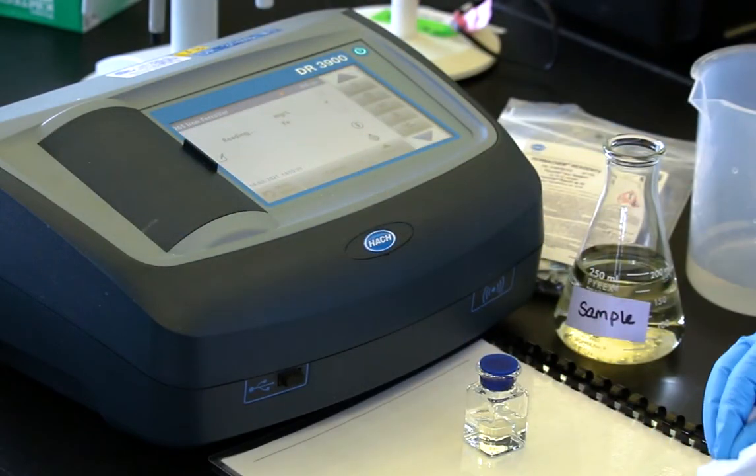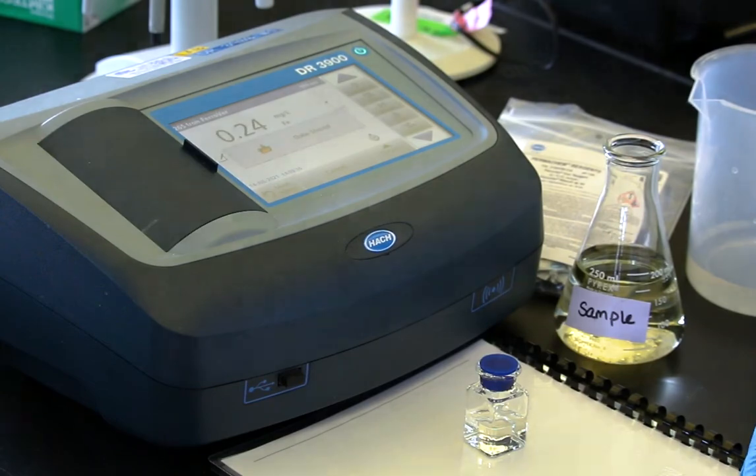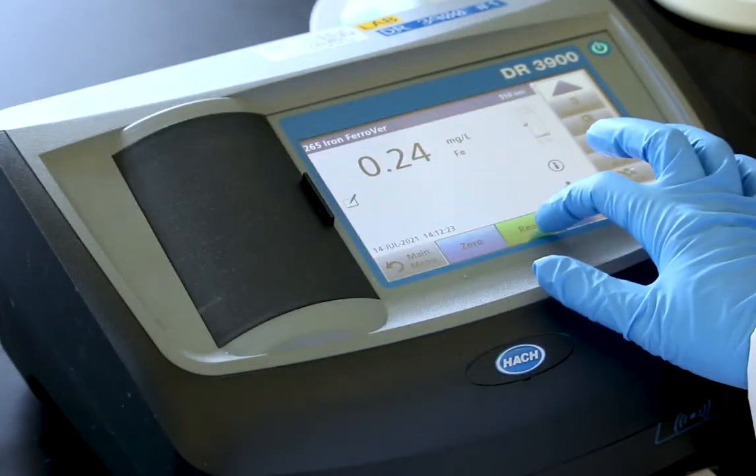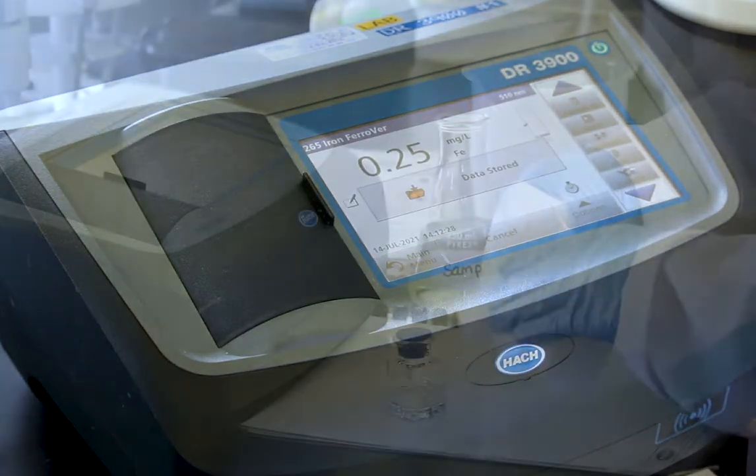Clean the outside of the sample cell containing the reagent and when the timer expires, insert the cell and press read. Record the sample result in milligrams per litre of iron.